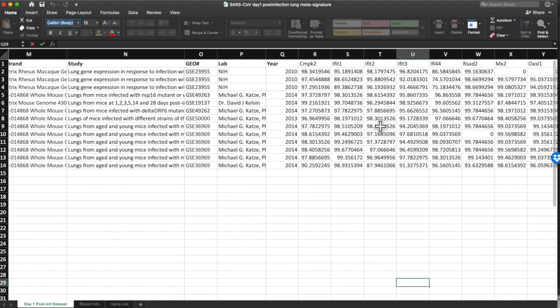The BaseSpace Correlation Engine platform we collected these data from only allows you to download the top 5,000 genes based on the sum of the Illumina scores across all datasets.